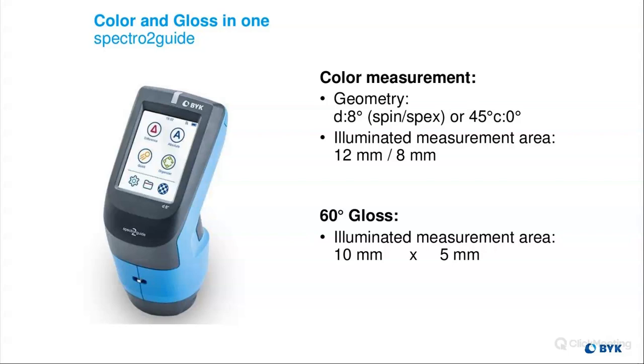So say those samples both ended up coming together in the field, there could be a very big difference between those 2 panels because that standard was slightly off. And with these digital standards, it's just a file that you can send and import to your instruments, and it only takes 5 minutes, and everybody has the same exact spectral profile and LAB values that they're using to measure these standards.